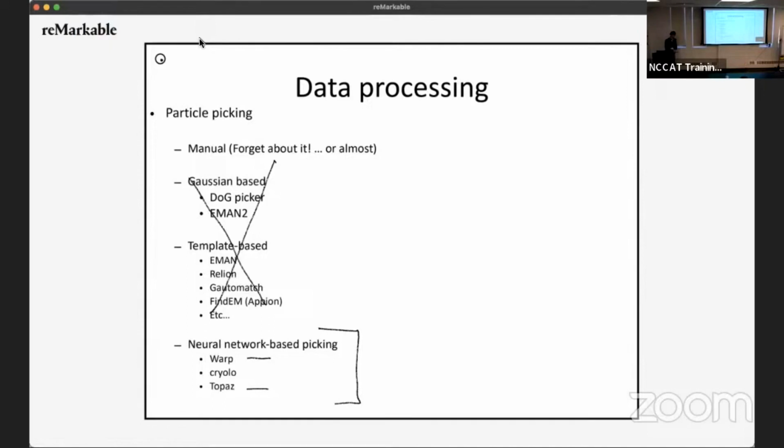What about the case when you don't know what your particle looks like? Excellent question. In a case where you don't know what your particle looks like, you know it's a protein, or a protein-RNA or RNA complex. Therefore, the general model that's been trained on many other data sets of different kinds will have some features of your protein, and therefore will be the best thing to use to start.